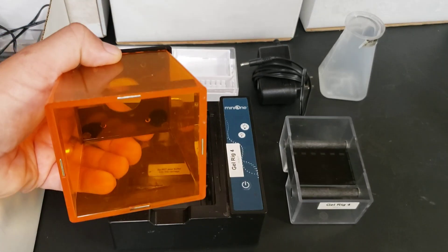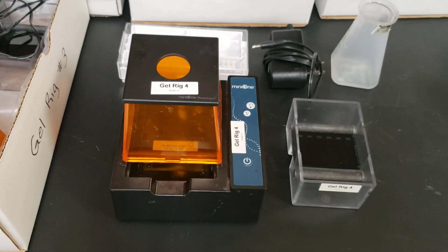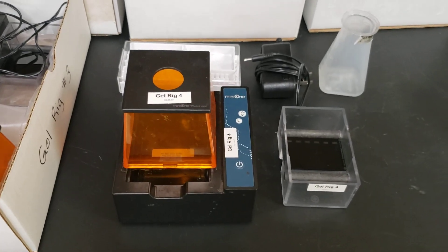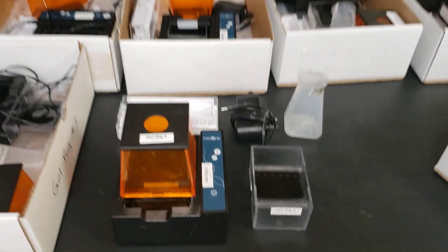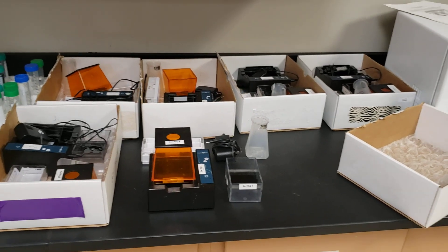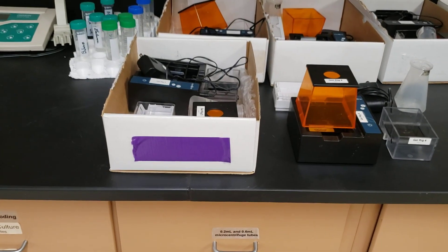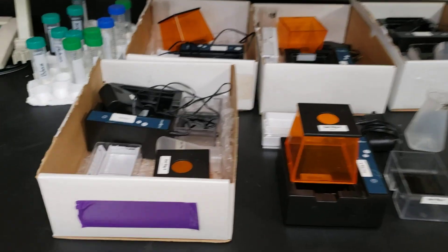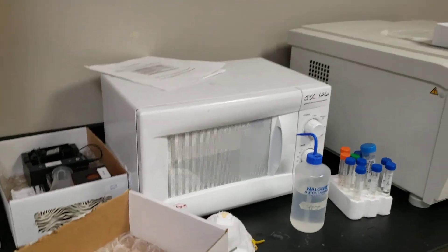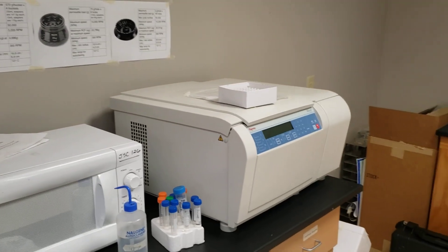The Mini One gel rigs have nice magnets that protect them, and students can turn on a light to see their gel images running. We get much better pictures on our transilluminator, but when we go into high school classrooms we take pictures directly off these gel rigs. Over the years I've been able to buy six of them — one for each bench. They're color-marked so students can only use the one assigned to their group. These gel rigs run very fast and work really well. I also have a dedicated microwave for heating and running our gels.